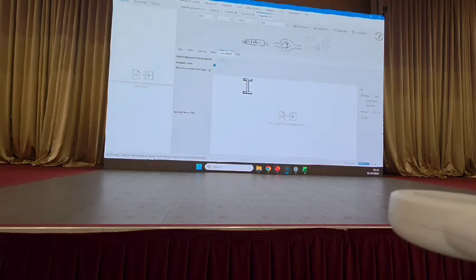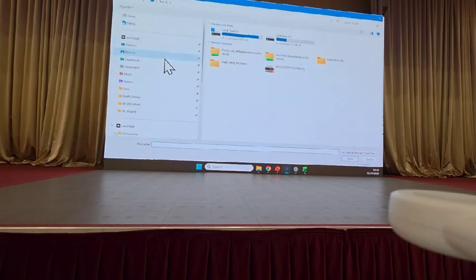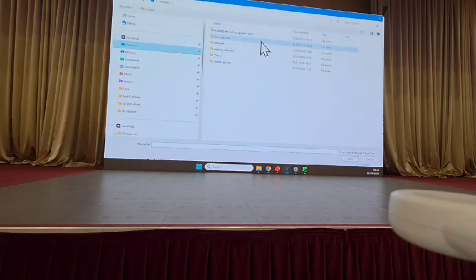So, with that being said, we need to import a library file. So again, please go to Select Files. And one of the files I provided you was this Mass Bank of North America MSMS library.